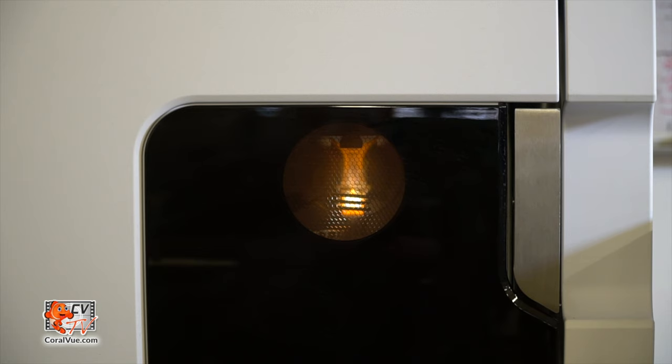The water sample goes into the plasma, which atomizes the electrons, exciting them into a higher state.